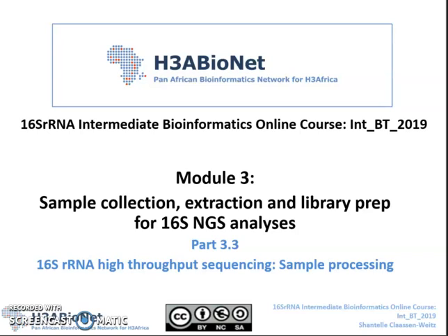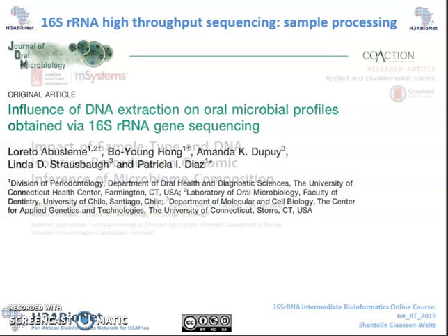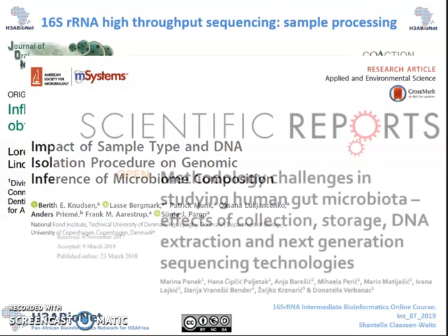Hi guys, in part 3.3 of module 3, we will be taking a look at the importance of an optimal DNA extraction protocol and how the extraction method and resultant DNA yield could influence sequencing results. A number of studies have shown that different DNA extraction protocols will produce differences in microbial communities.